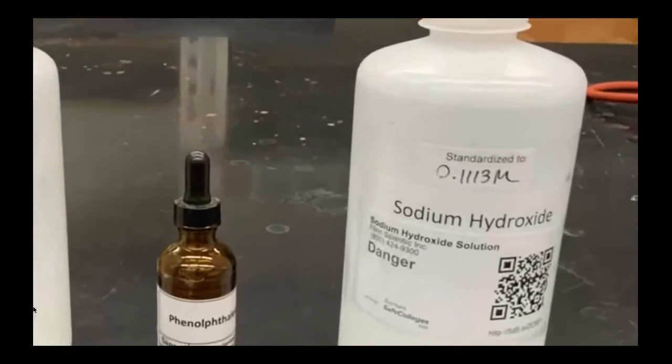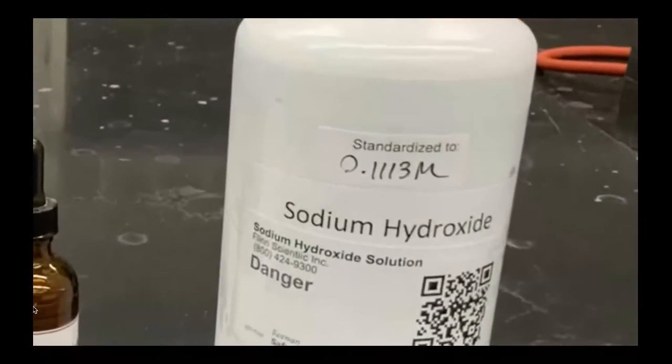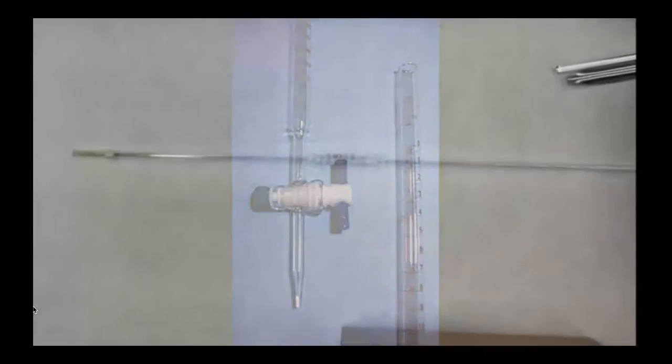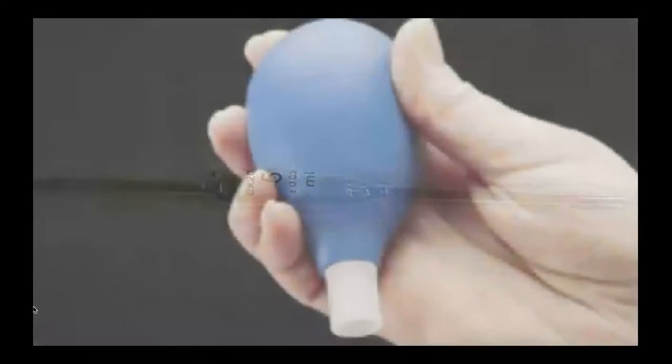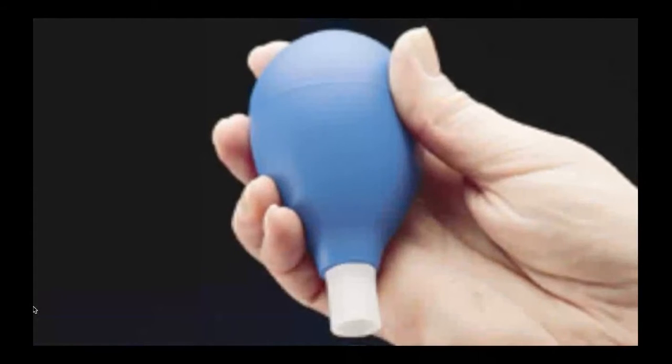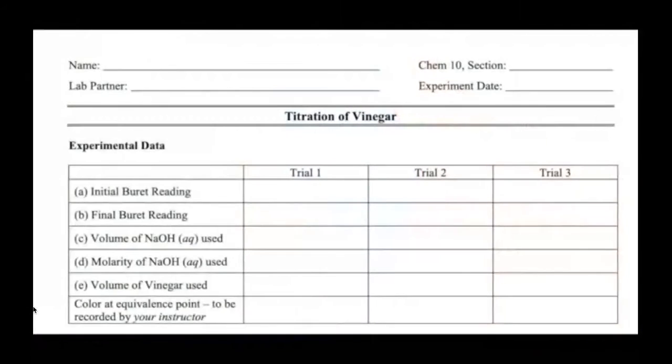Please make note of the concentration of sodium hydroxide: 0.1113 moles per liter. We're also going to use a burette and a 5 milliliter pipette. We also need a suction bulb to draw up the liquid for the pipette.